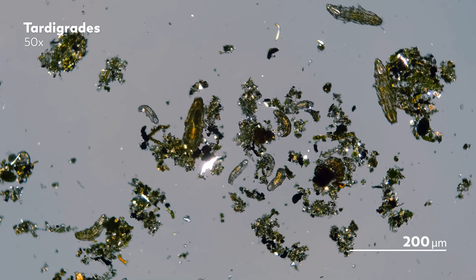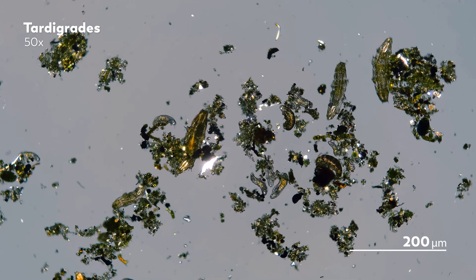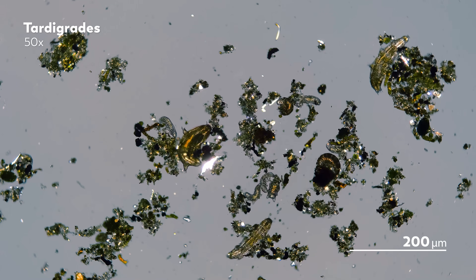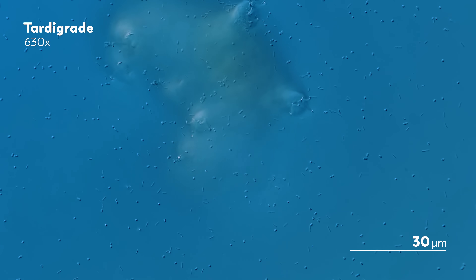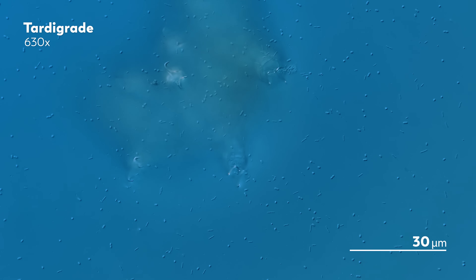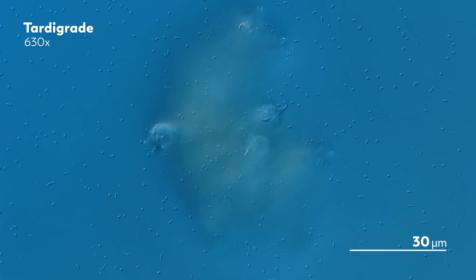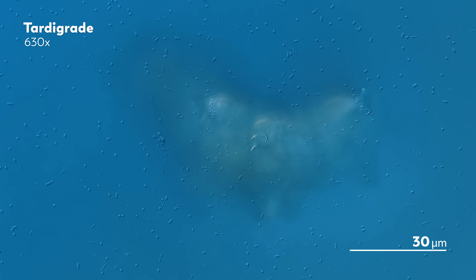One of the cool things about having caught so many tardigrades at once is that you can see how much variety there is to them. Here we have a few tardigrades that look like giants, crawling in a variety pack of miniature tardigrades. You can also catch tardigrades in some funny situations, like this tardigrade that's using its clawed feet to walk along the glass slide. Tardigrades cannot swim, but they will use their claws to walk around underwater. And glass is a tough surface for this one at the moment, but over time, it will get better.